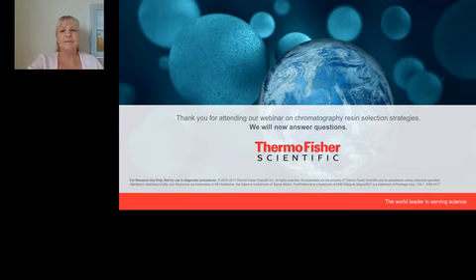Let's get started. Our first question is for Scott. Scott, can magnetic agarose beads be used for immunoprecipitation or co-IP experiments?